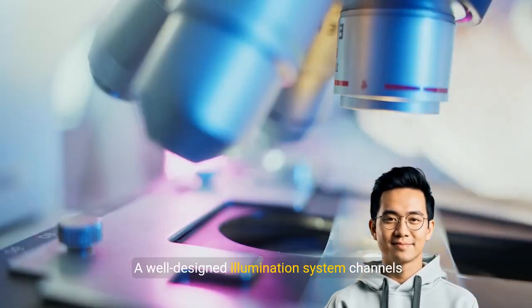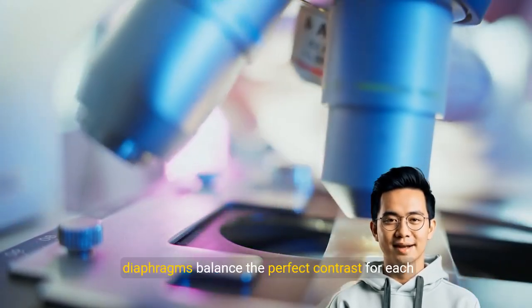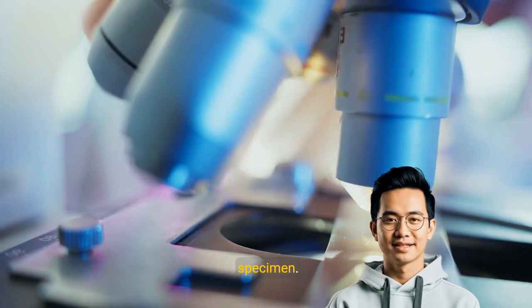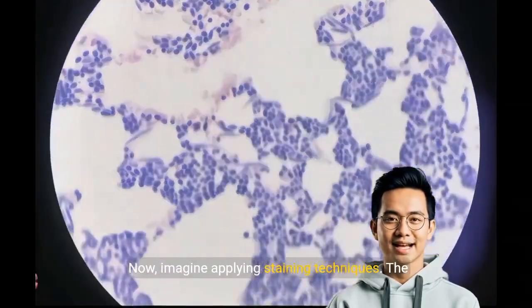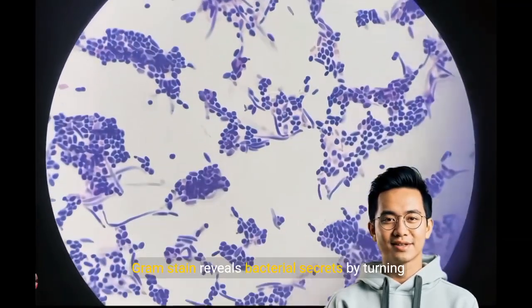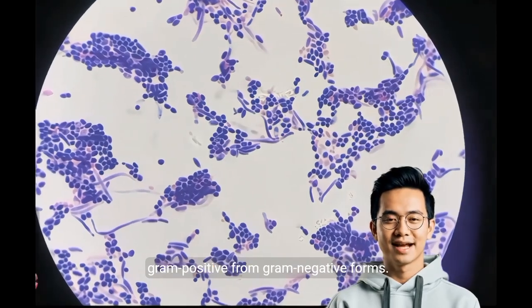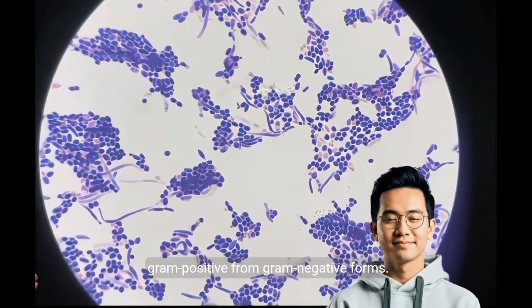A well-designed illumination system channels light through a condenser lens, while controlled diaphragms balance the perfect contrast for each specimen. Now imagine applying staining techniques. The Gram stain reveals bacterial secrets by turning cells purple or pink, clearly distinguishing gram-positive from gram-negative forms.